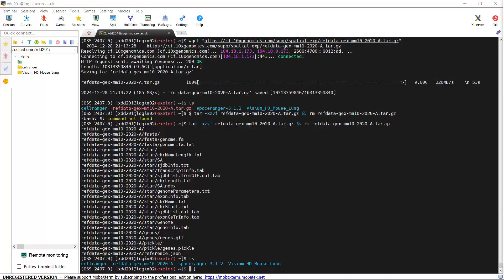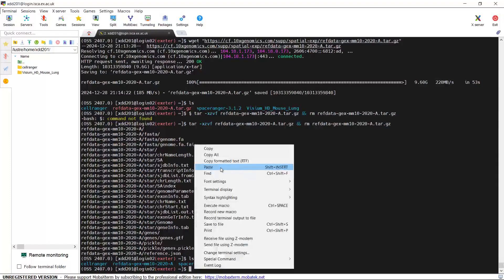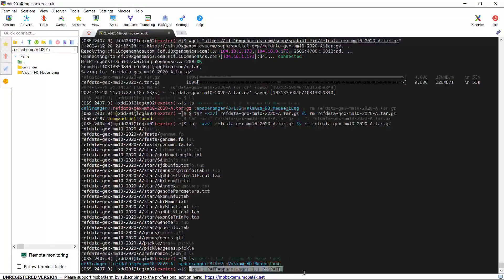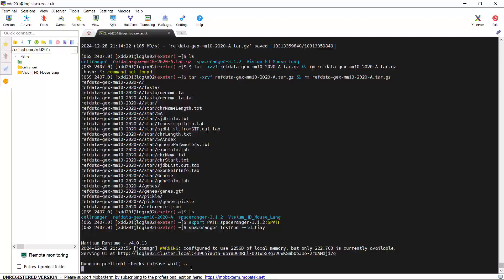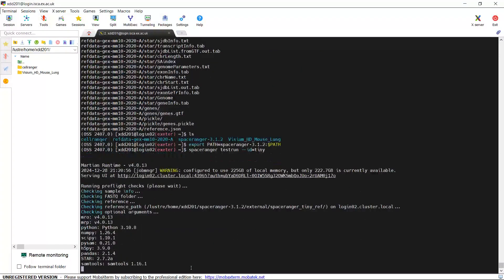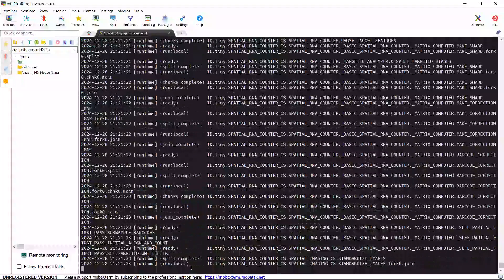We downloaded and unpacked both the Space Ranger software and the mouse reference dataset. Now we can export the Space Ranger function to the current path. We can use the code here to export the path. Now we should be able to run the Space Ranger count function. Before we analyze our VGM-HD mouse data, we can do a test run to see if the Space Ranger count function works. Let's do the test run. You can see it is running, which means we correctly installed the Space Ranger software.